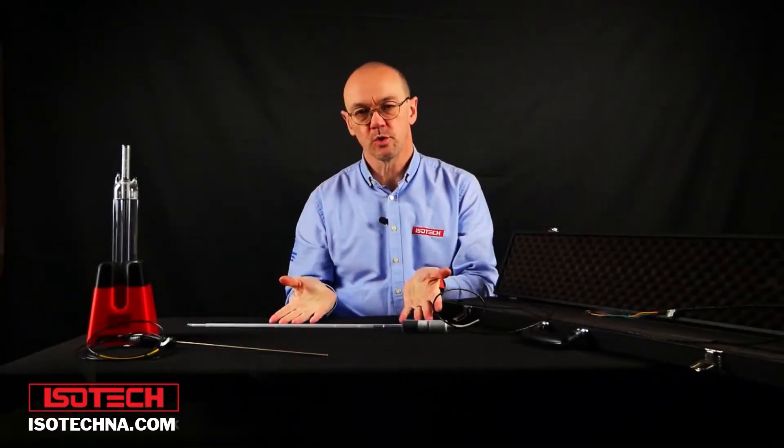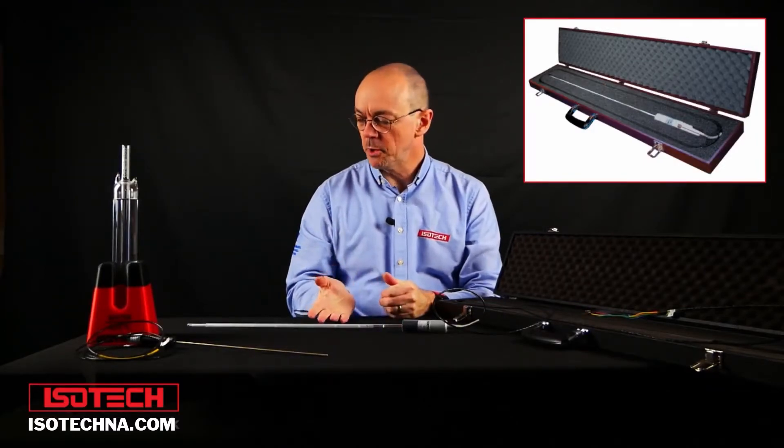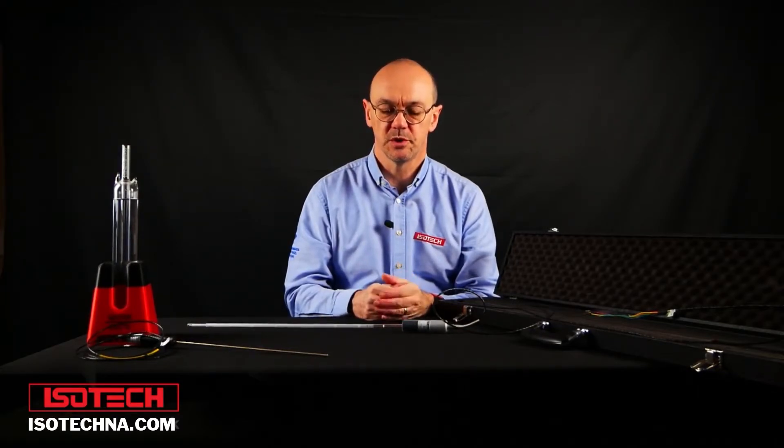Here we have a quartz-sheathed Standard Platinum Resistance Thermometer. This model can be used from minus 200 to 660 degrees C. With appropriate calibration, the uncertainty can be just a few thousandths of a degree C. And over narrow ranges close to zero, we can have uncertainties smaller than one thousandth of a degree C.